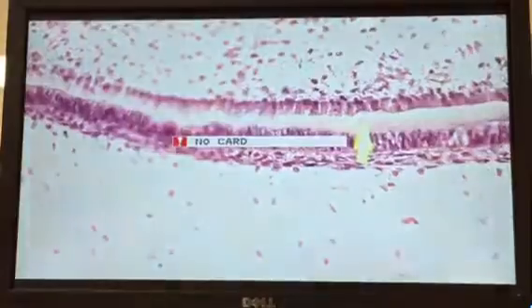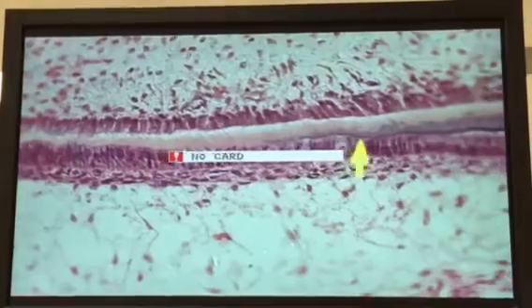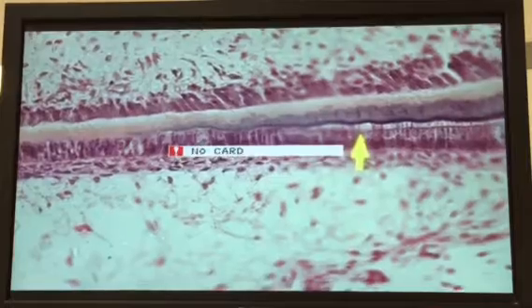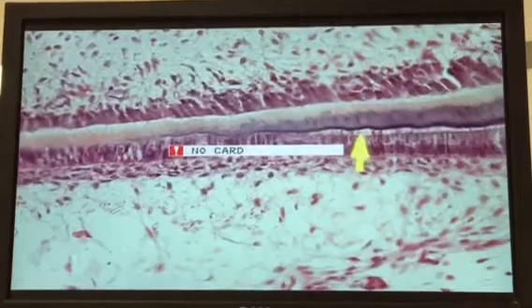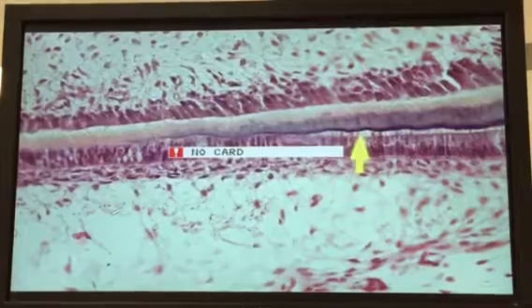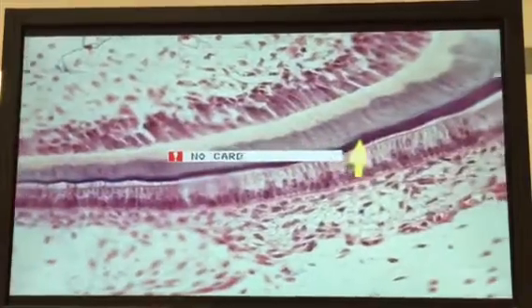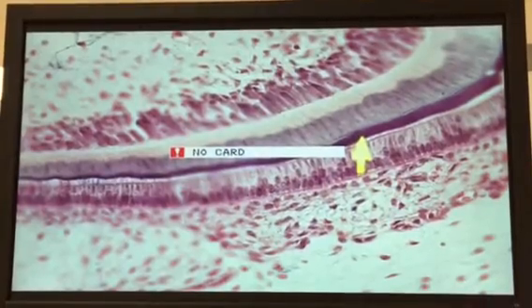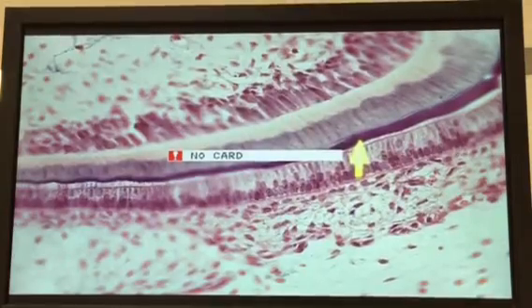Let me open up the iris diaphragm here a little bit. And then we begin to see some enamel being laid down. And so right in here, we know that we are in the synthetic or the formative stage, because right there are Tomes processes. So this has to be synthetic or formative stage. And as we come up a bit, you can actually see within that enamel that's being laid down, those little pits in which Tomes process was in before we had any shrinkage of the tissue due to the processing.